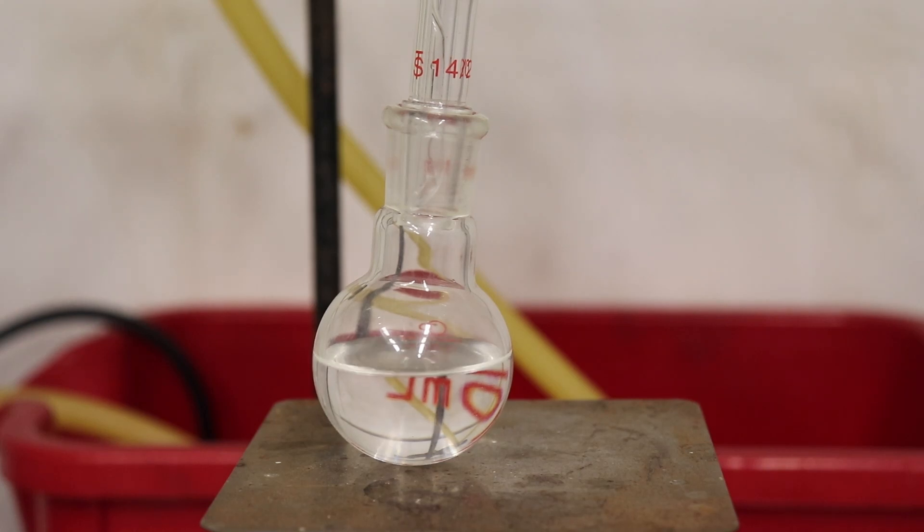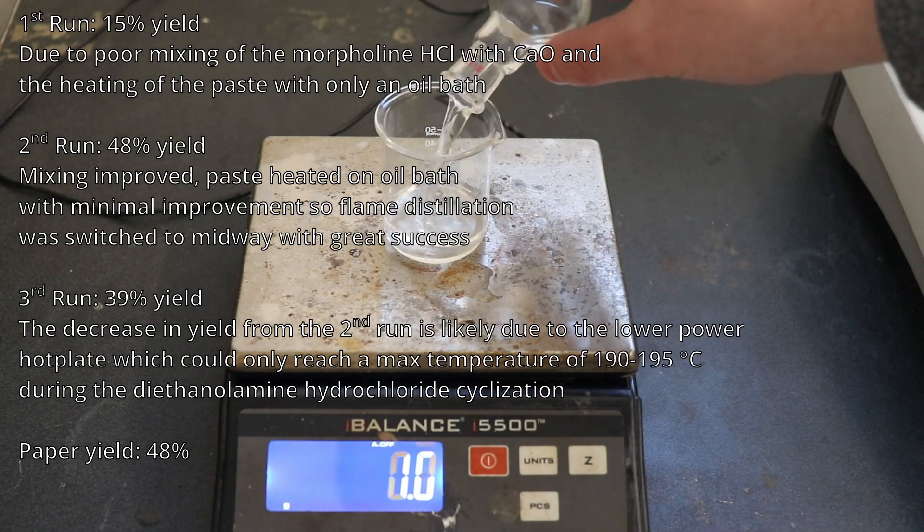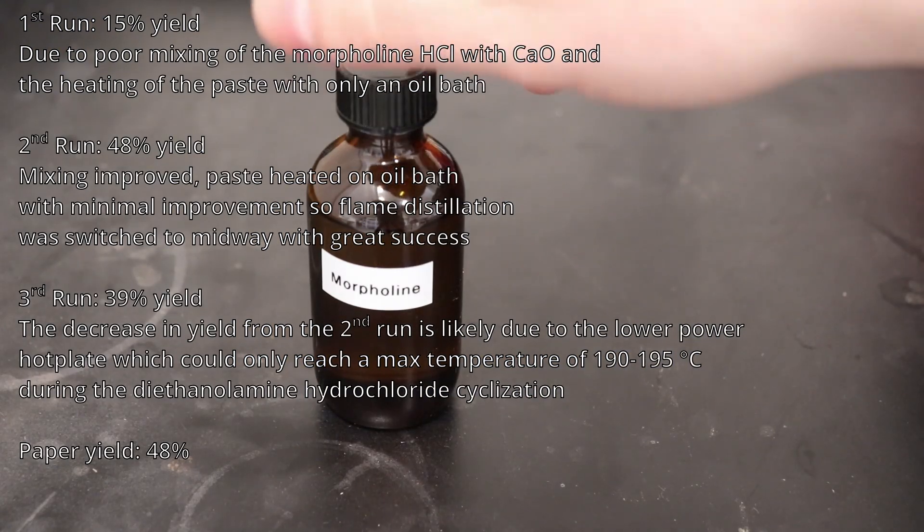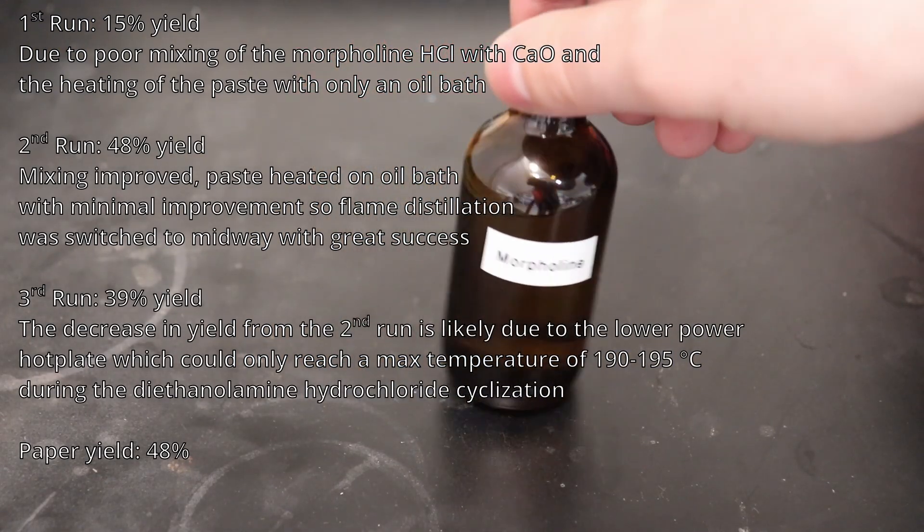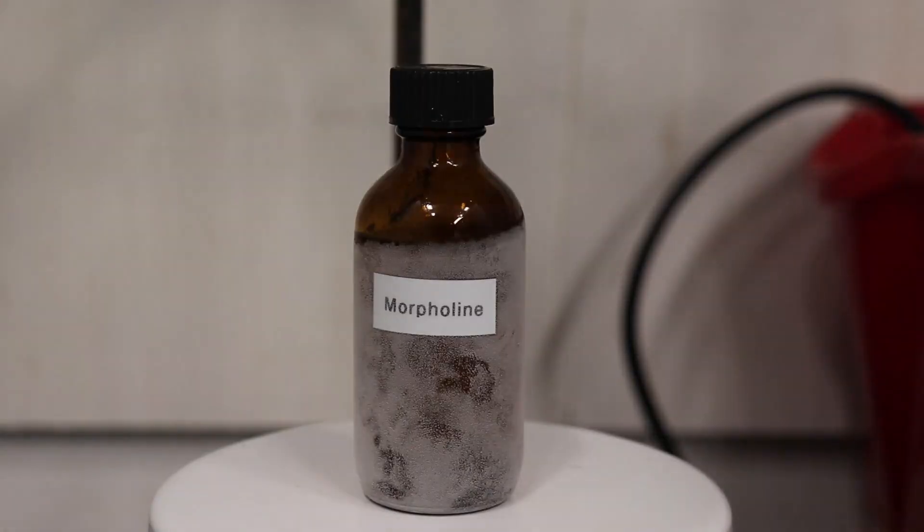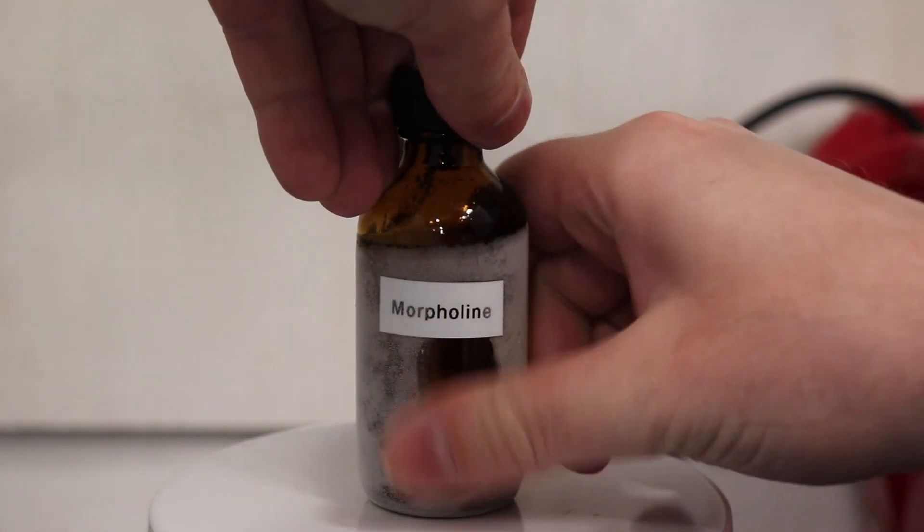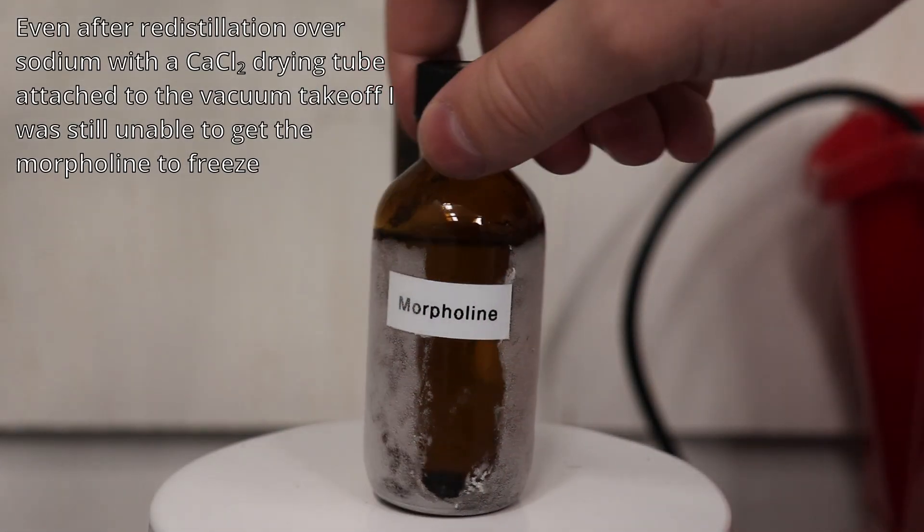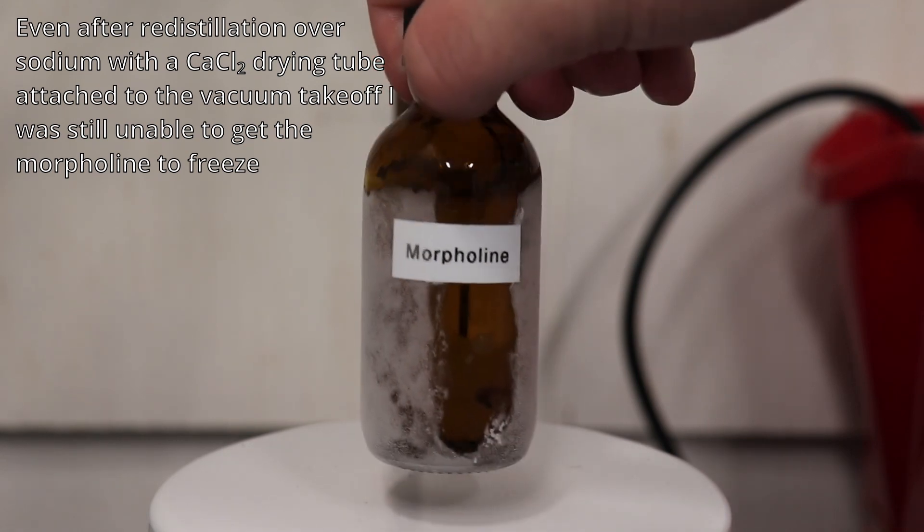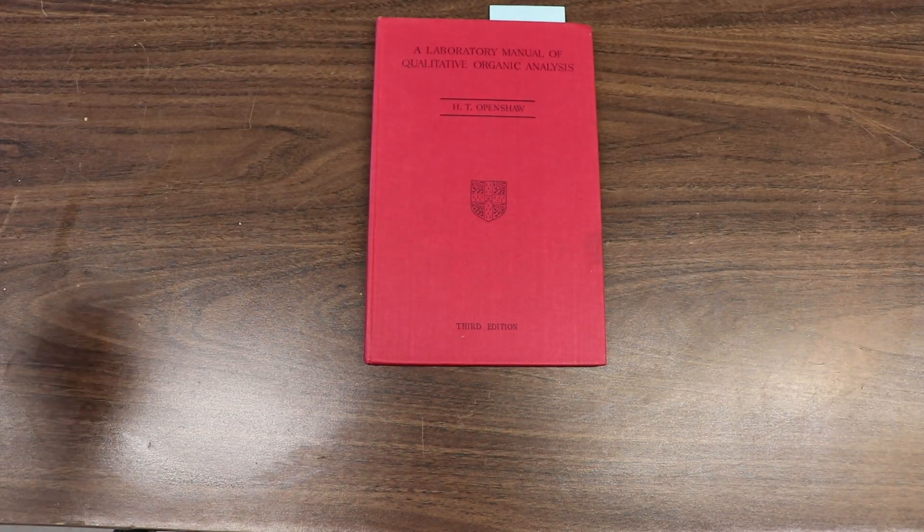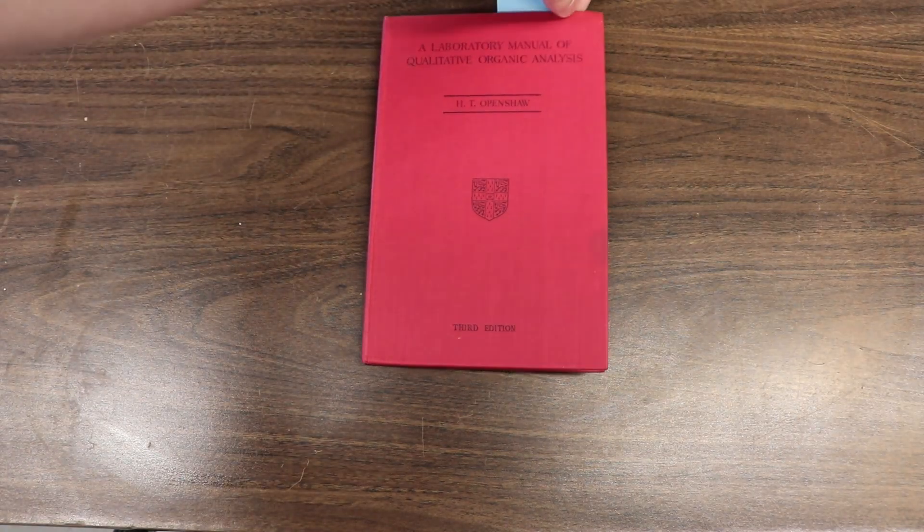The boiling point was already fairly good evidence of the successful preparation of morpholine. However, I wanted to gather some more evidence to further corroborate this result. The first test I did was the freezing point of morpholine. The theoretical freezing point of morpholine is negative 5 degrees Celsius. However, even at negative 15, it was still not frozen. This result is not super surprising as morpholine is extremely hygroscopic, and it's quite possible that even a tiny amount of water will greatly depress the freezing point of morpholine.